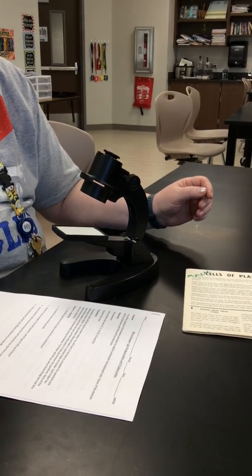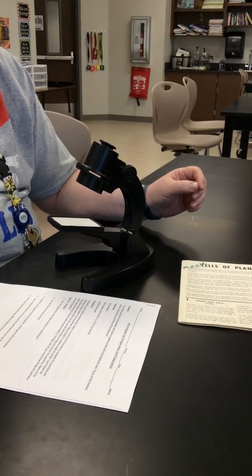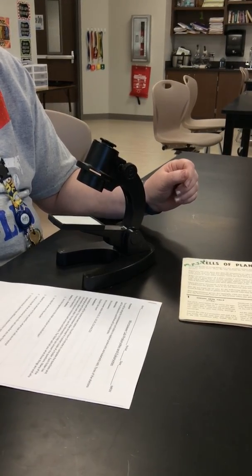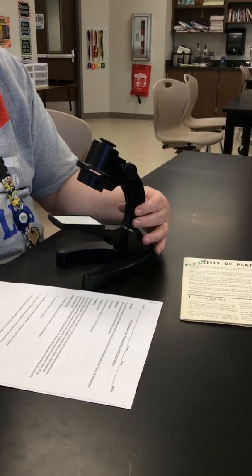Hi guys, welcome to another lab flip video. It's been a while but we haven't forgotten about them. We're actually going to be doing a two-day lab — Friday and Monday — and we're going to be using these nifty little gadgets called micro viewers.